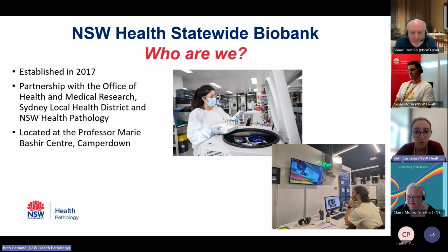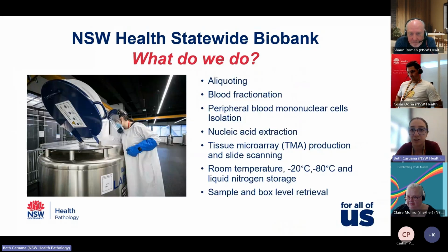We're across the road from RPA in the Professor Marie Bashir Centre, and we provide biobanking services to government, industry and academic organisations, including aliquoting, blood fractionation, peripheral blood mononuclear cell isolation, nucleic acid extraction, tissue microarray production and slide scanning, storage at various temperatures, as well as retrieval of samples.